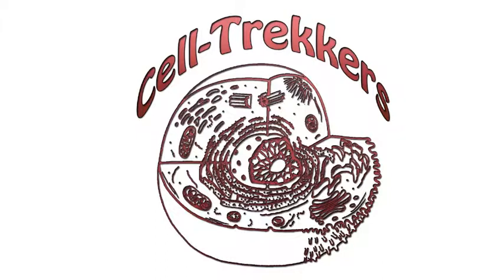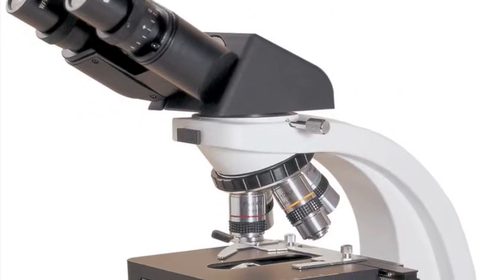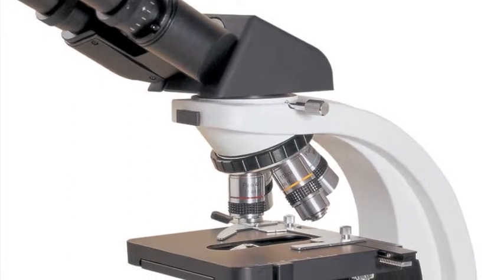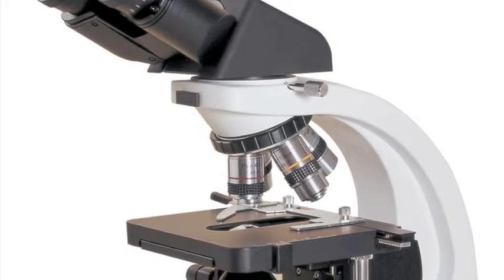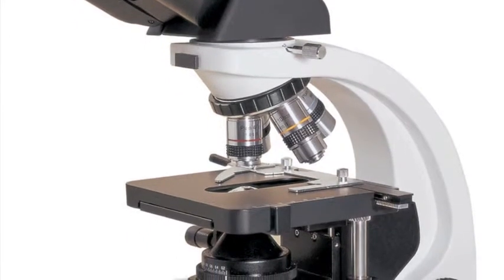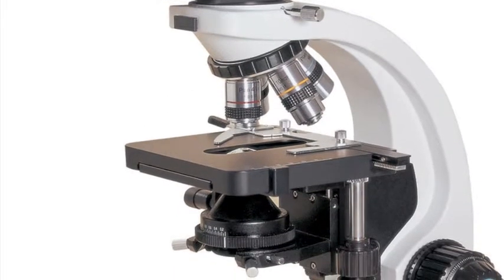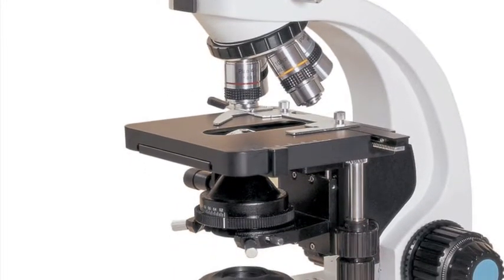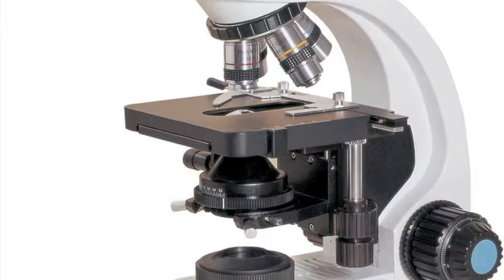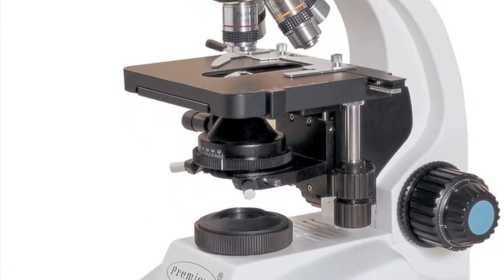I, the magnificent microscope, shall be your guide today. As you can see in this photograph here, I am a fabulous piece of scientific equipment. Just to tell you a little bit about myself, my specialty is magnification. Or, for those of you sleeping in the back of the room, I make little things appear larger. I am an absolute must when it comes to looking at cells of any form.